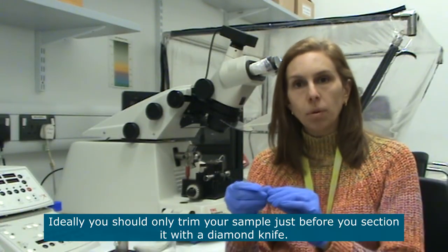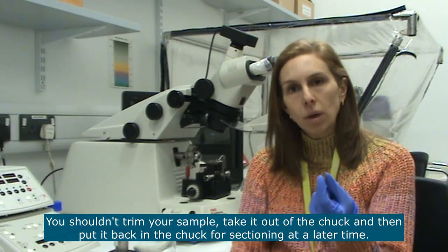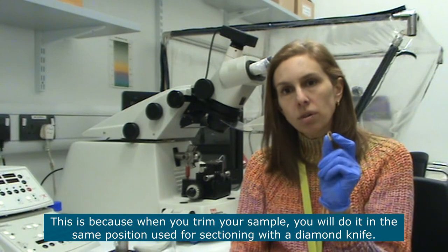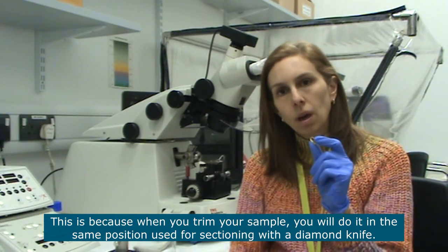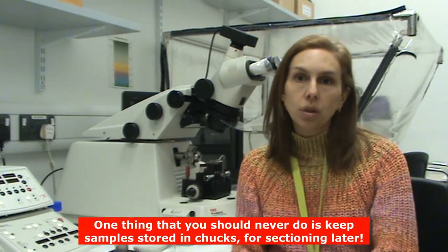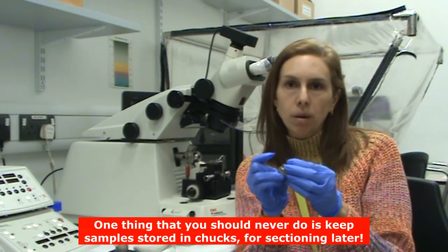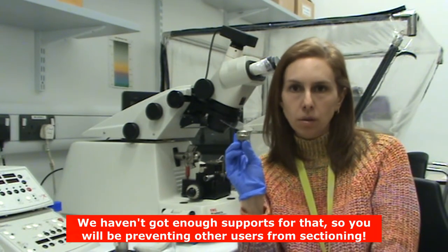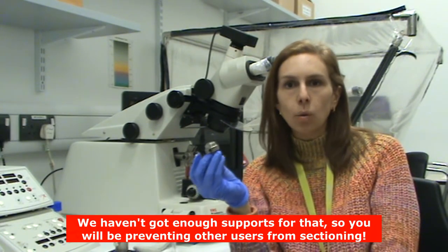Ideally you should trim your sample just before you section it with a diamond knife. You shouldn't trim your sample one day, take it out of the support, and then put it back in and section, because when you trim your sample you're going to trim it in the same position you will use for sectioning with a diamond knife, and if you take your sample out of the support it will lose that positioning. You should never keep your sample in a support after you've finished using the microtome, as we don't have many chucks in the unit and keeping one in a drawer takes it away from another user.